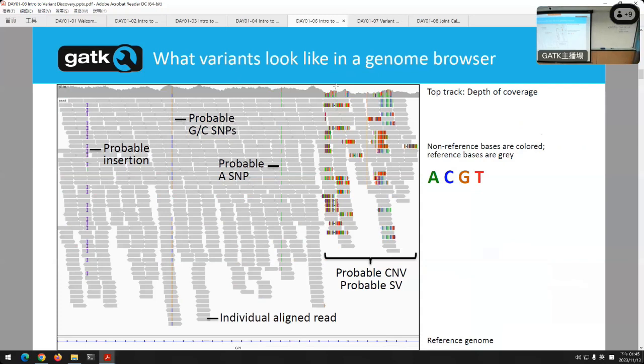And that would be a SNP, a single nucleotide polymorphism, where you have your bases changed, but there's no extra or missing bases. Now look at the stuff on the right, all that color. When Emma was talking about soft clip bases that don't align, this is usually what happens: part of the reads are aligning, and then the ends of them are not.